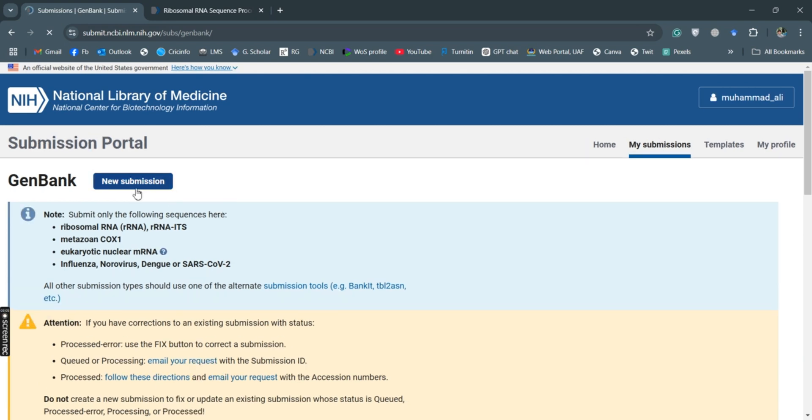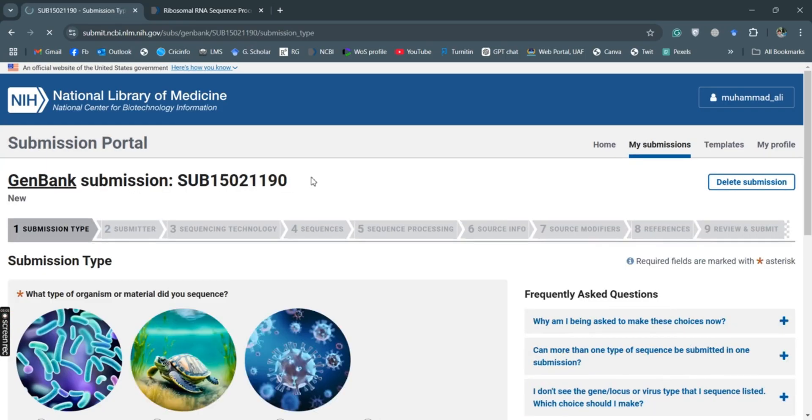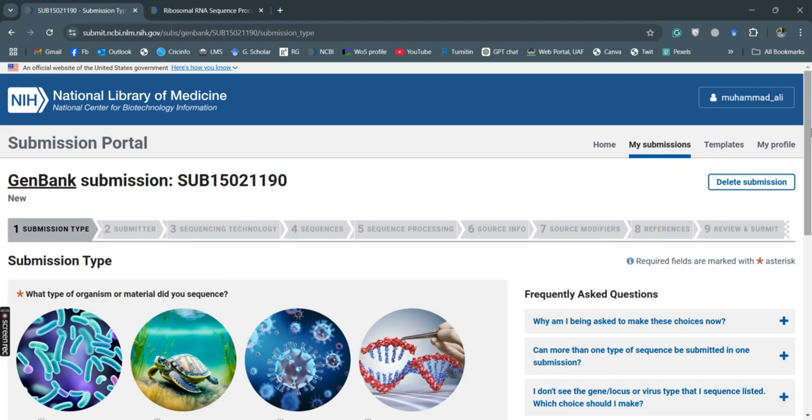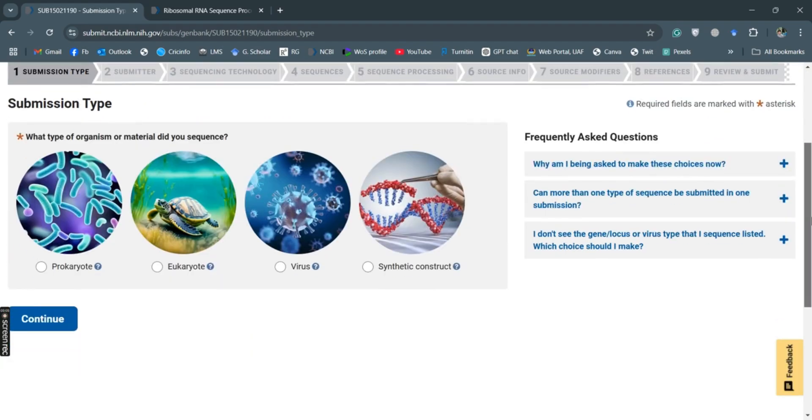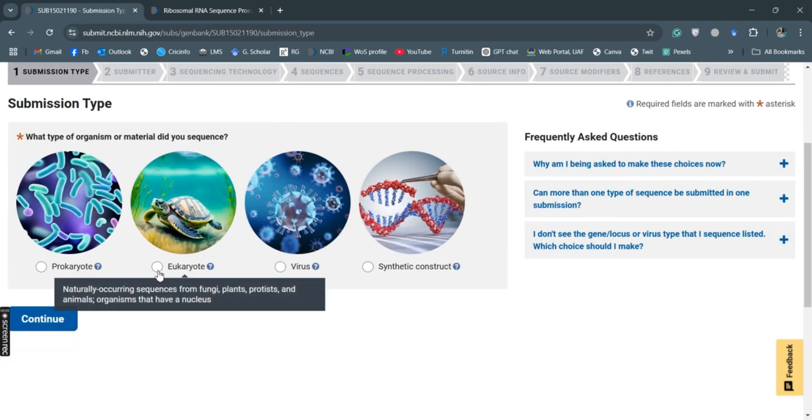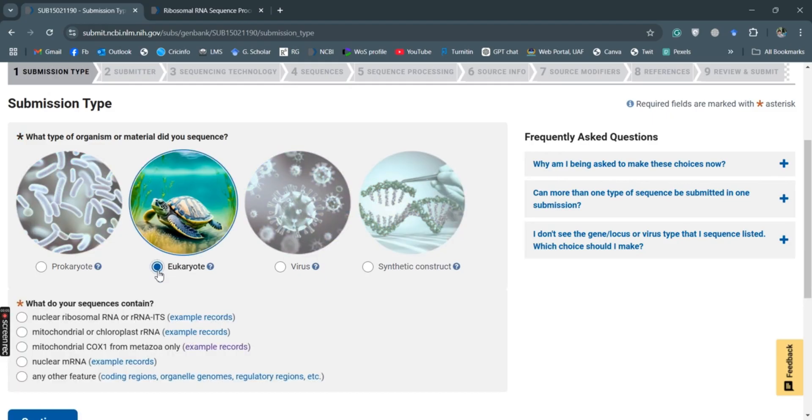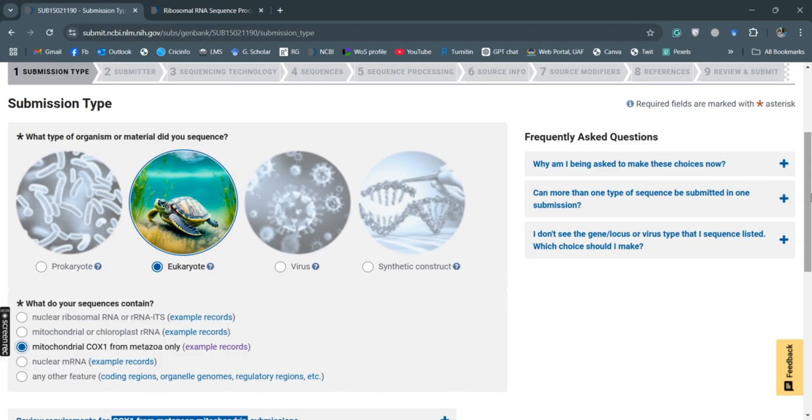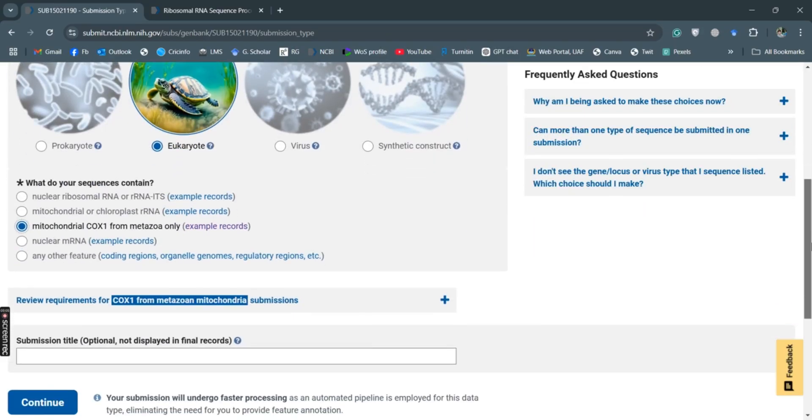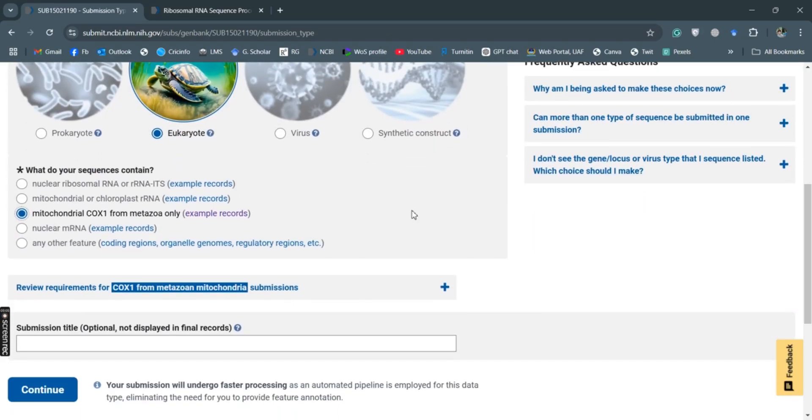New submission. It will ask what kind of DNA you want to submit. Because this is nematode DNA, this is eukaryote, and here it is mitochondrial COX1 format. So nematodes are metazoan, so we'll click this and continue.